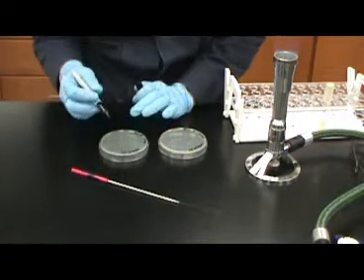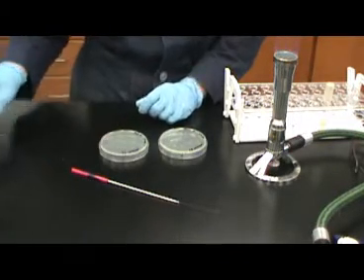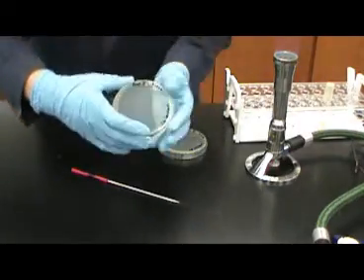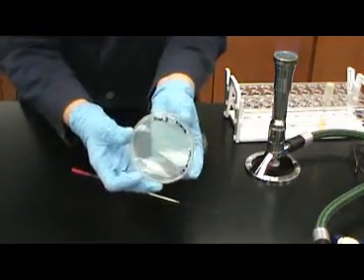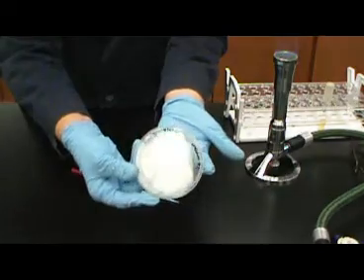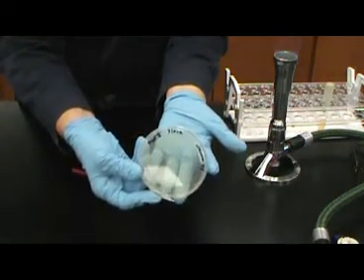For best results, we suggest that you run two isolation streak plates the first time you attempt isolation. You should label the plate with your name, the date, and the number of your unknown.